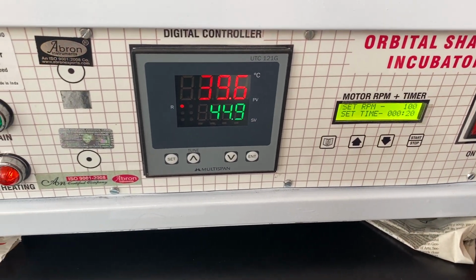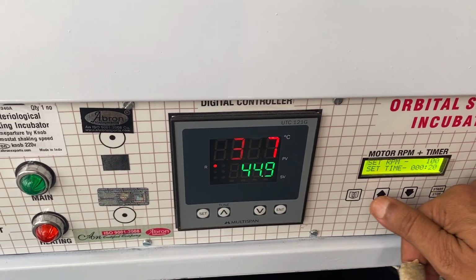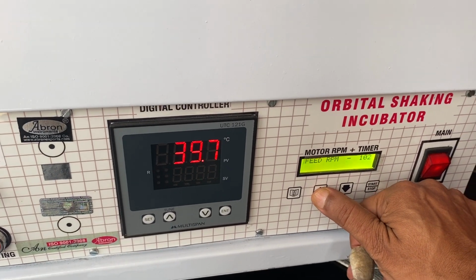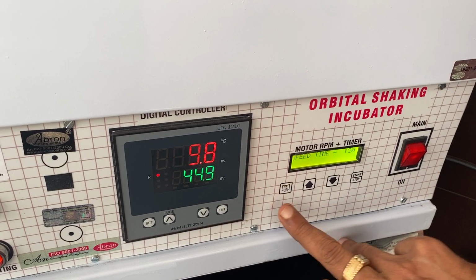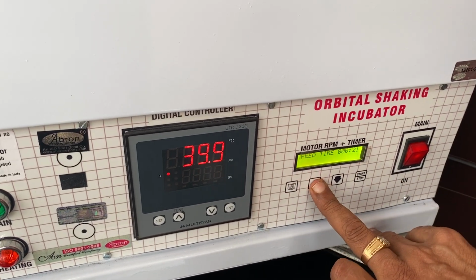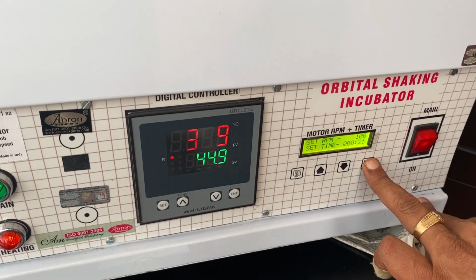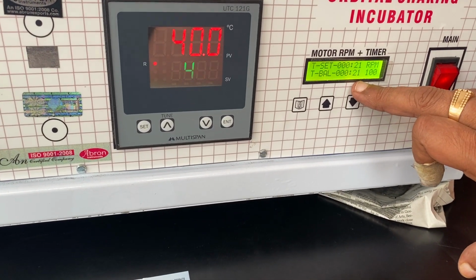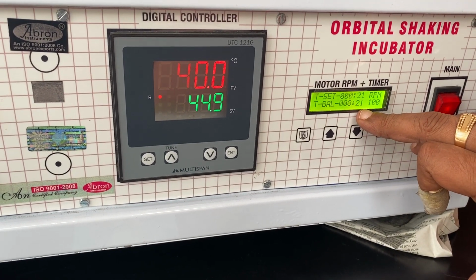That's the simple thing. Now it is set for 20 seconds. I can change it. Now this is RPM; I can increase it or decrease it. That's how I am setting it. Then the memory is 20 seconds. I can make it 21 seconds, then memorize it and start. The RPM is now 100, and the seconds are 21, which is counting down. The timer is coming.